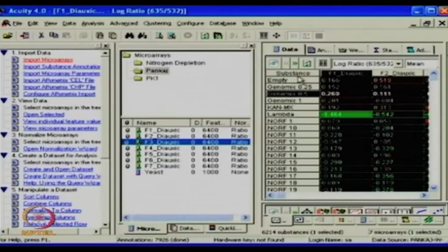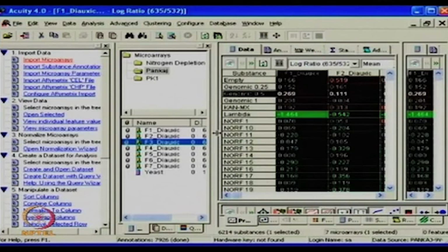So once you have all the data normalized after the import, and you have the annotation and the parameter file ready for you, there are a few ways with which you can look at the data. I think before moving forward, it's important to ensure that normalization was done properly, and one needs to look at each slide carefully. Yes. As we discussed earlier, it's very essential to have the same normalization process done for all.